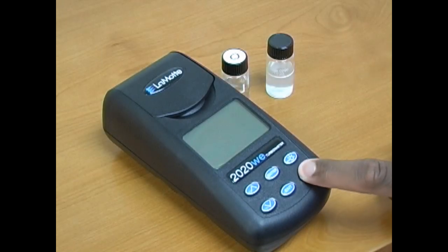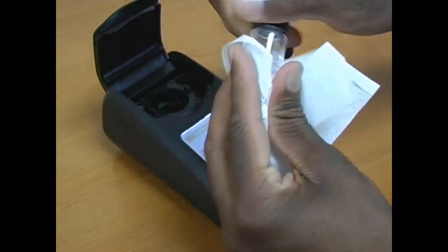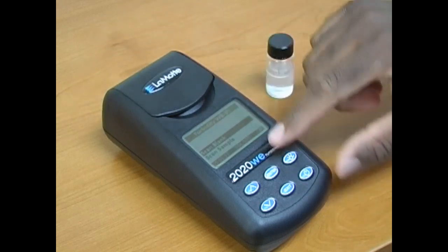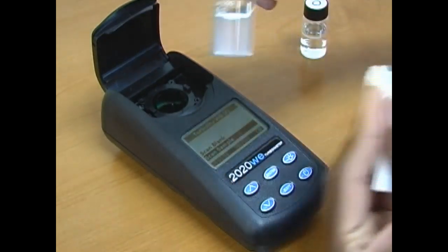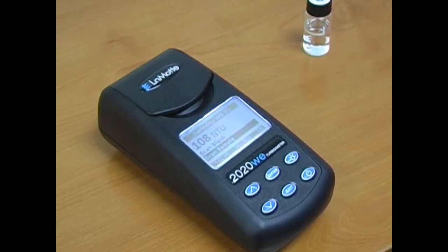Press the power button to turn the meter on and select measure. Select turbidity with 0 NTU. Wipe the tube and place it into the chamber, being sure to align the indicator arrow with the line on the tube. Press enter to scan the sample. Dry the sample tube, place it into the chamber, and press enter to scan the sample. The sample value is displayed.